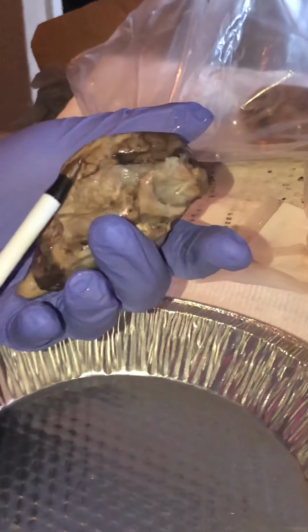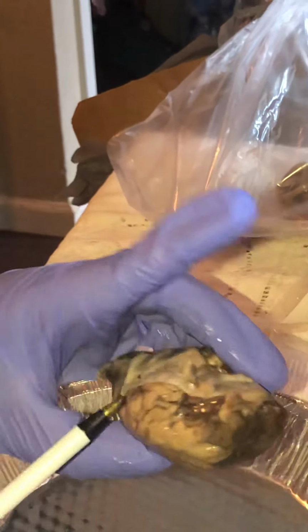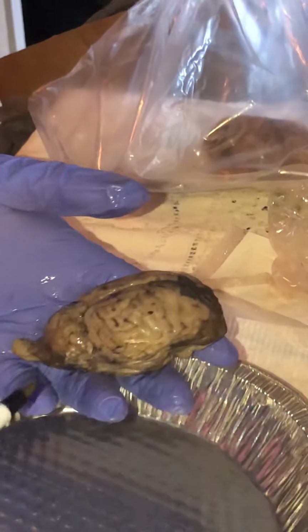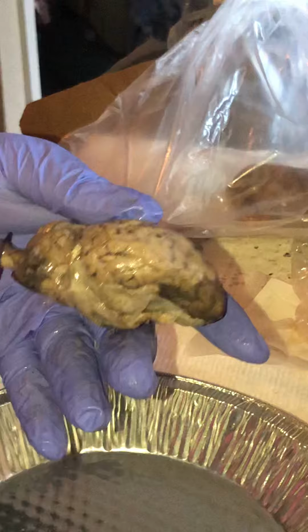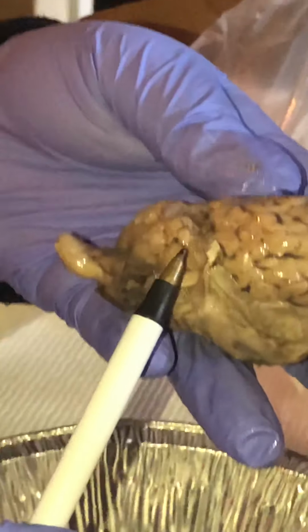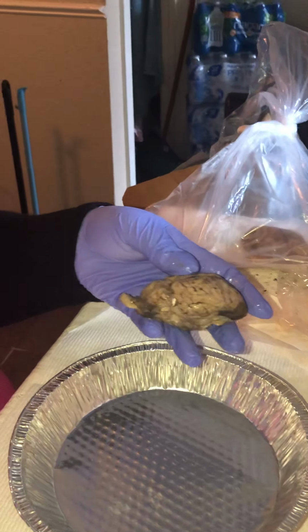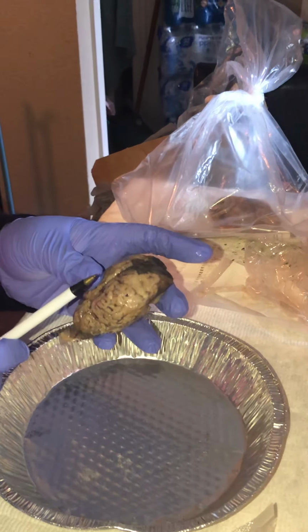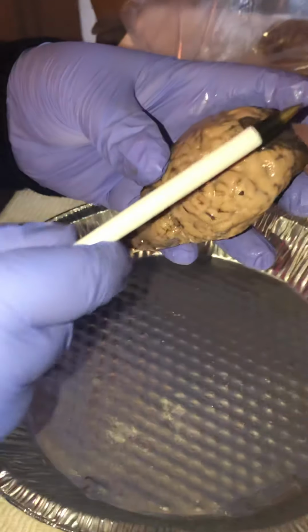Then we have the temporal lobes, the right and the left, located here. And that's for memory, hearing and emotion. And then back here, we have the occipital lobes, and that is for your vision. Then we have the longitudinal fissure, which is right here.